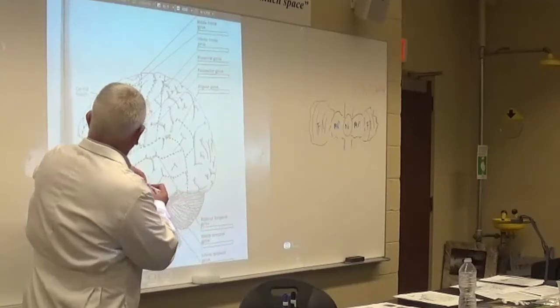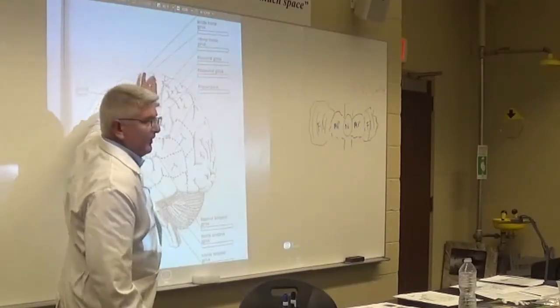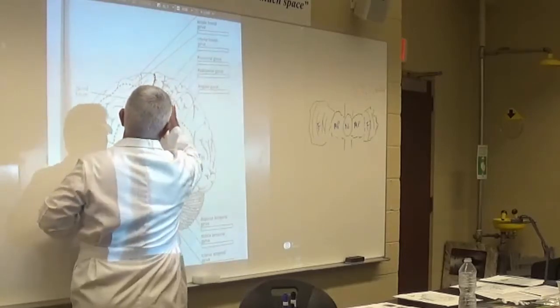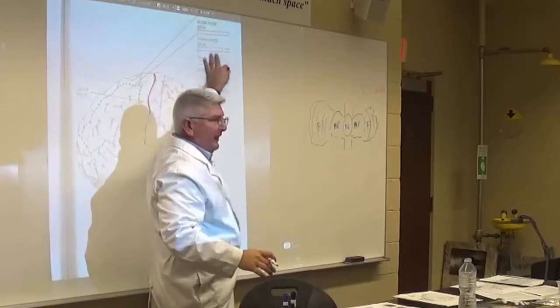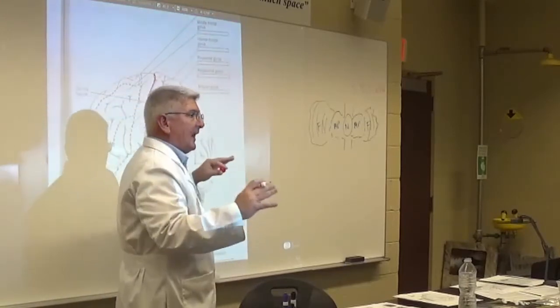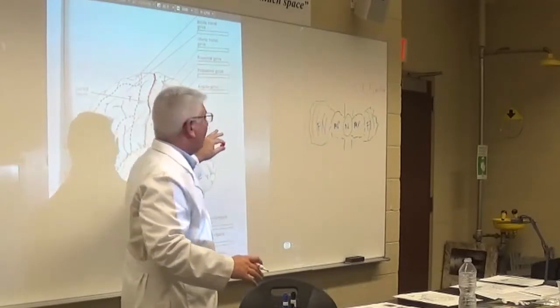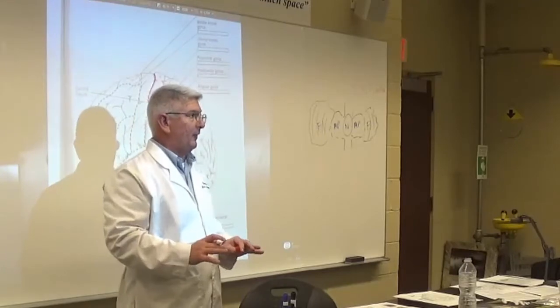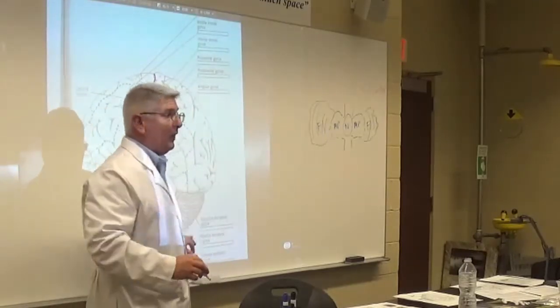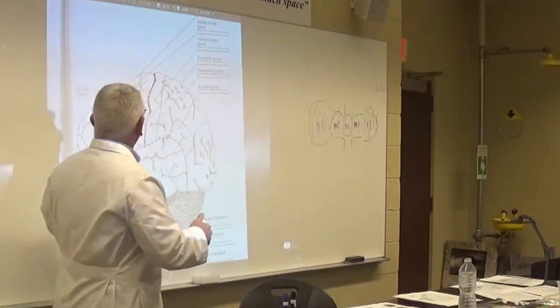Here we have the central sulcus, the most centrally located sulcus, right? It's not one of the things on here. That doesn't mean I can't mark it on the quiz on this slide, okay? So don't think that the only thing I'm going to mark on 7-3 are these things that are over here. That's not right, okay? This is a great one to go through and name everything, okay?